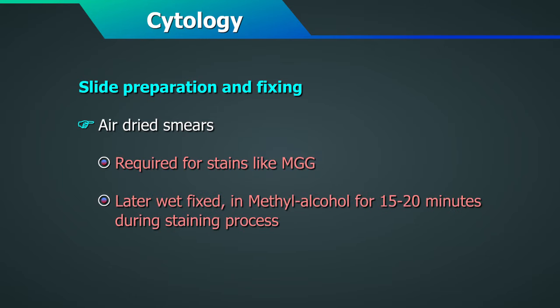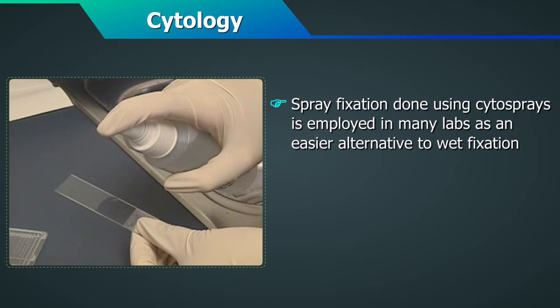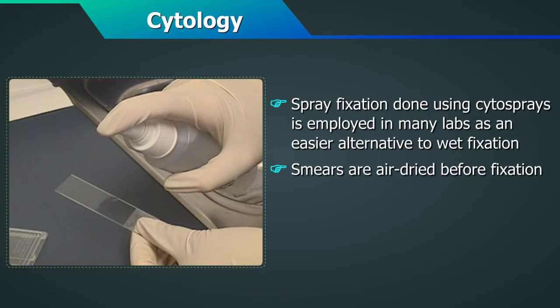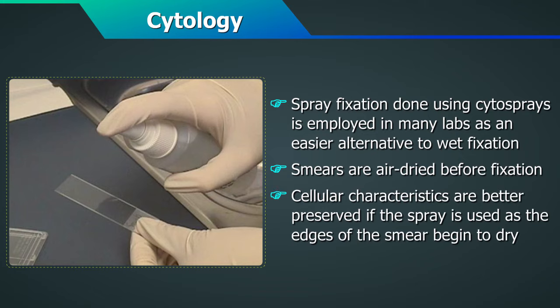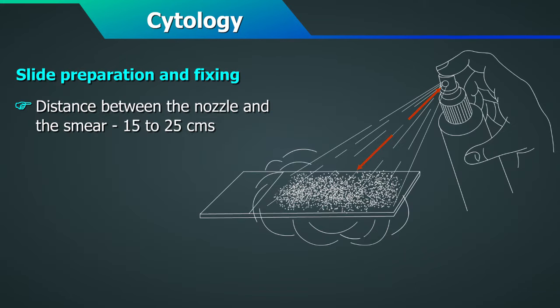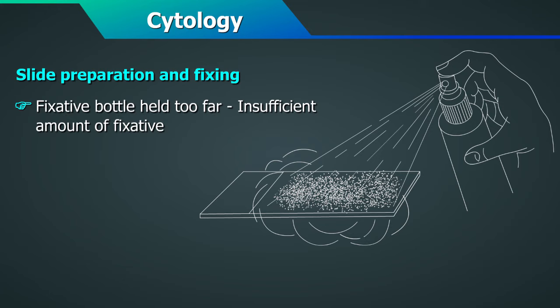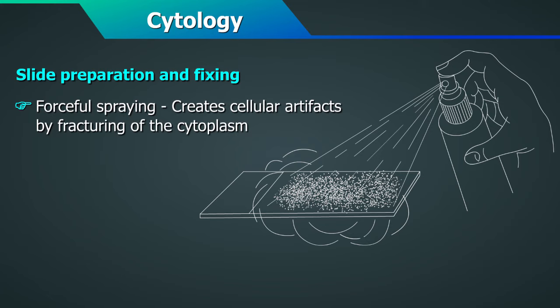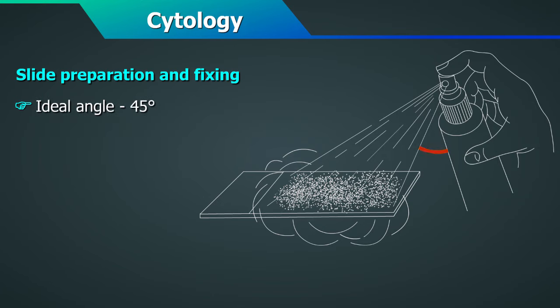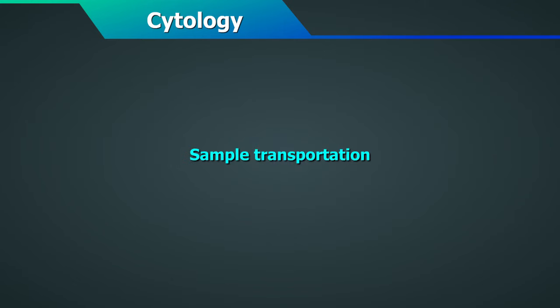Air-dried smears are later wet-fixed in methyl alcohol for 15–20 minutes during the staining process. Spray fixation using cytosprays is employed in many labs as an easier alternative to wet fixation. The cellular characteristics are better preserved if the spray is used as the edges of the smear begin to dry. The distance between the nozzle and the smear should be about 15–25 cm. If the fixative bottle is held too close, cells can be dislodged; if too far, insufficient fixative reaches the smear. Too forceful spraying can also create cellular artifacts by fracturing of the cytoplasm. An ideal angle for spraying is 45 degrees.